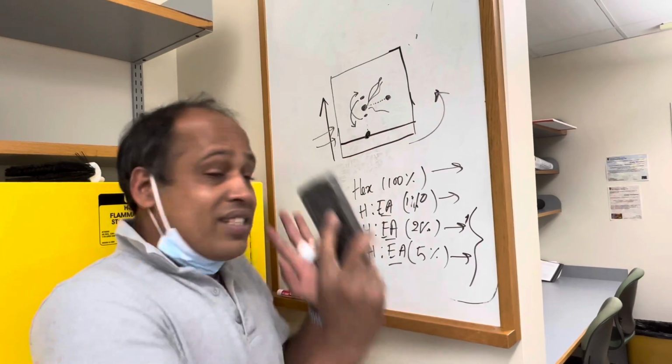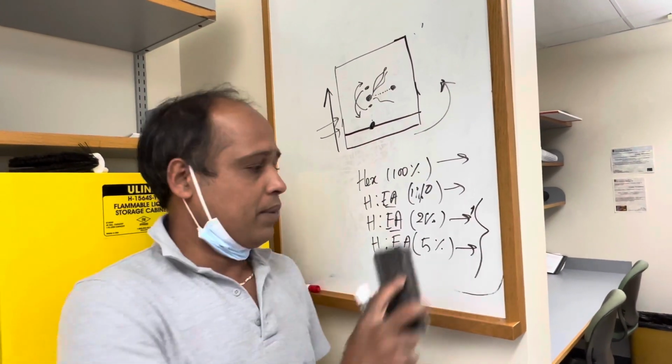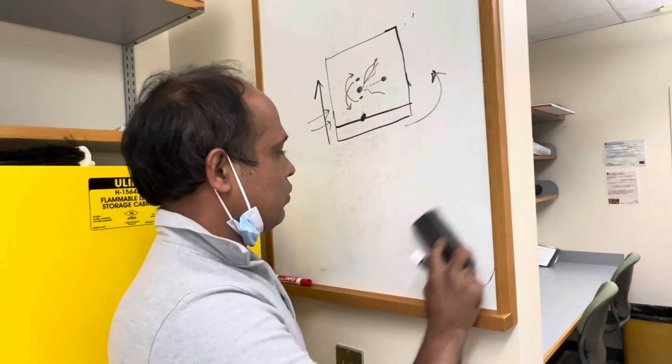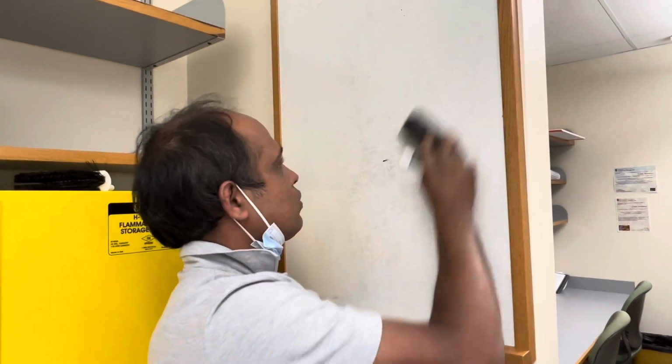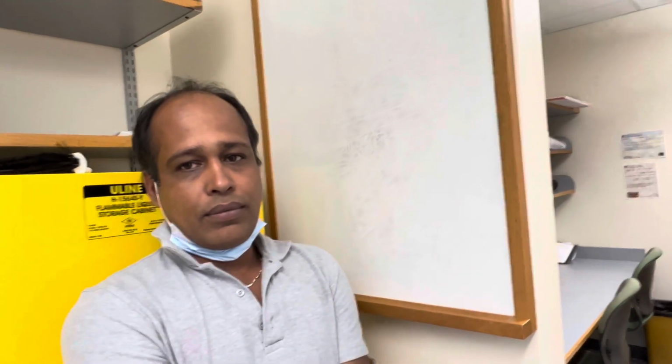Okay, I think this will help you for your answer. Yeah, what is your question? But how do you relate that to the column itself? As you saw, what I did initially was the 20%, and then down was the 3%. How are you able to predict live during the column itself that maybe now is a good time to increase the polarity? Oh no, not yet, not right now.